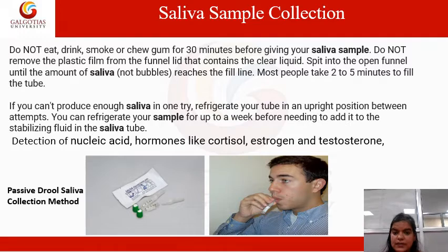Now let's talk about the saliva sample. This is very common for COVID testing, but it is also important for most lung-related diagnoses. So, while taking the saliva sample, we must not eat, drink, smoke, or chew gum for at least 30 minutes.